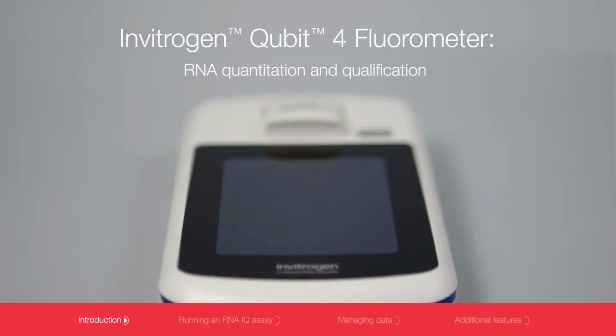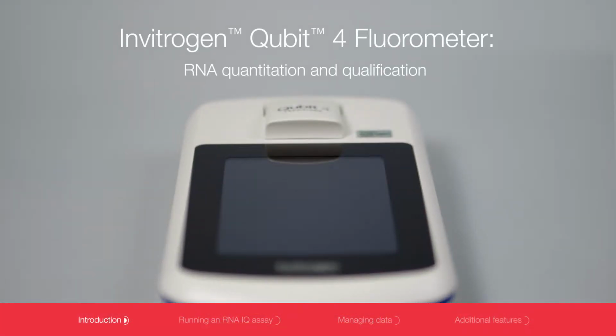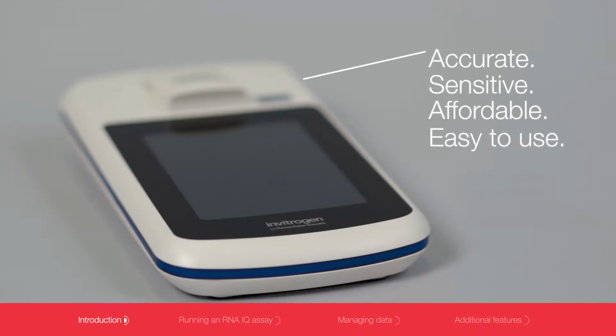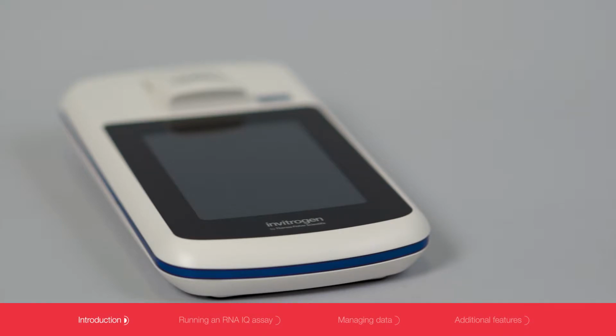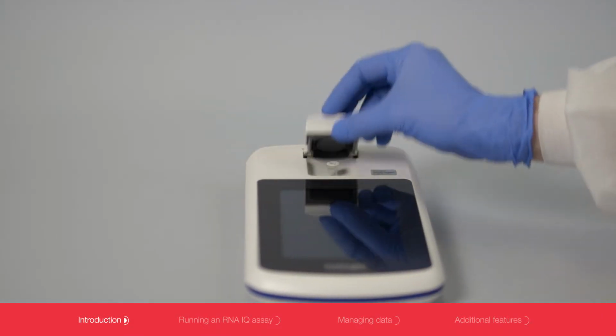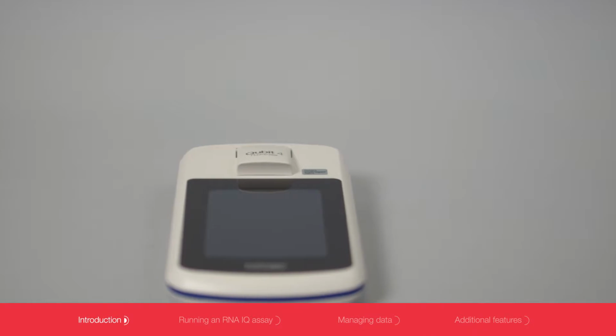Invitrogen Qubit fluorometric quantitation comprises the easy-to-use Qubit 4 fluorometer and sensitive, specific Qubit quantitation assays. Based on the detection of target-specific fluorescence, this integrated system is more sensitive than UV absorbance-based quantitation of DNA, RNA, and protein, making it ideal for precious samples and demanding applications.